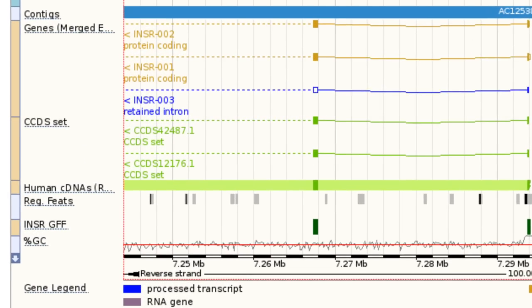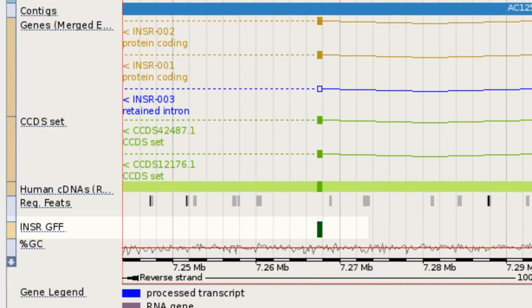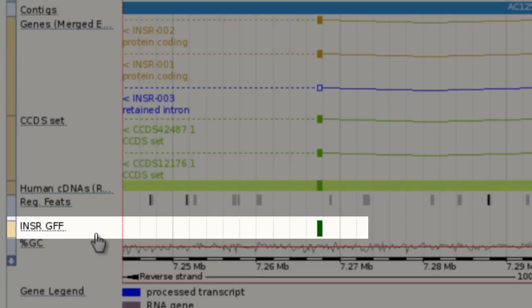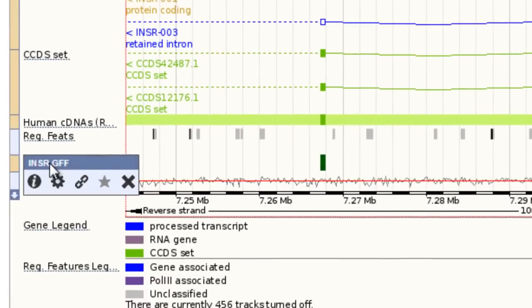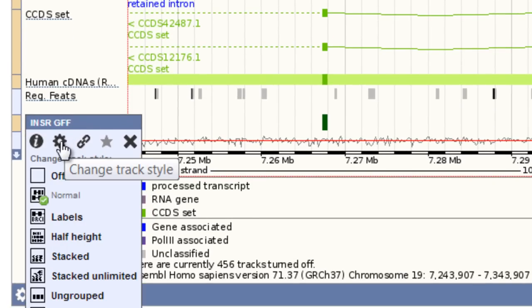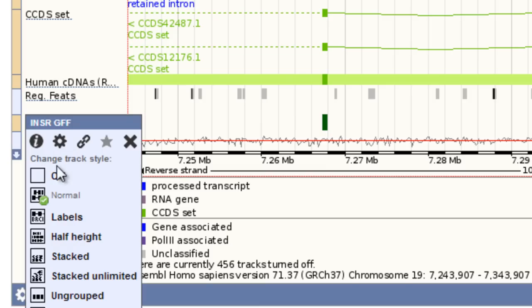I can see my data as these green blocks. Maybe I want to add some labels — to do this, hover over the track name and change the track style. I'll change it to labels.